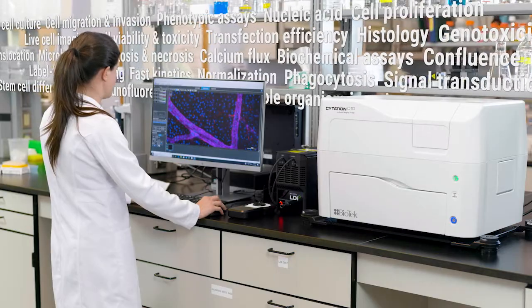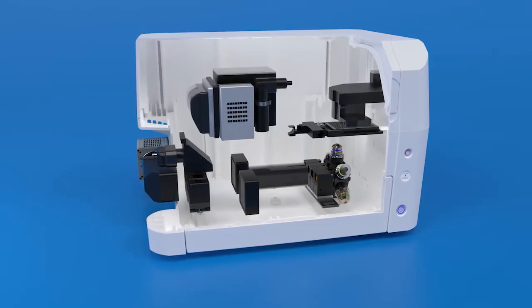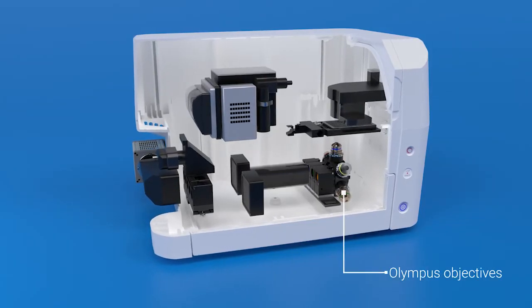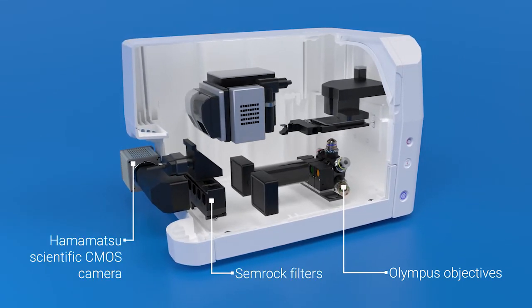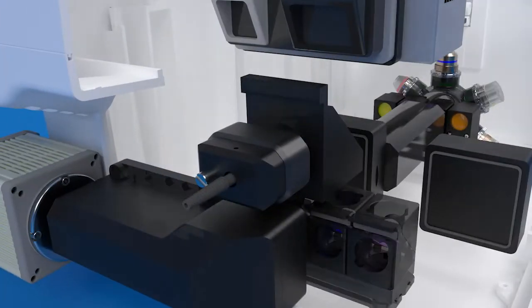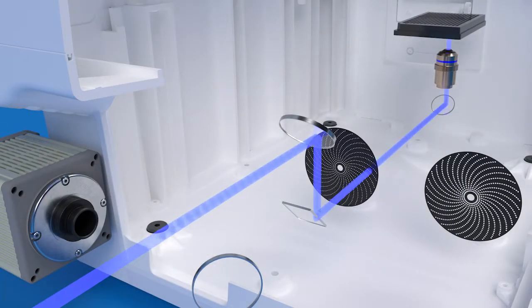Citation C10 uses high-quality optical components, including Olympus objectives, a Hamamatsu scientific CMOS camera, and Semrock filters in an efficient optical light path to capture crystal-clear quantitative images.